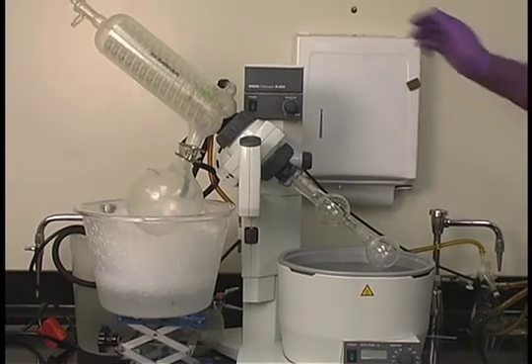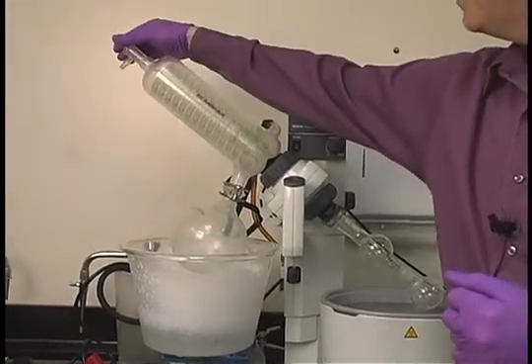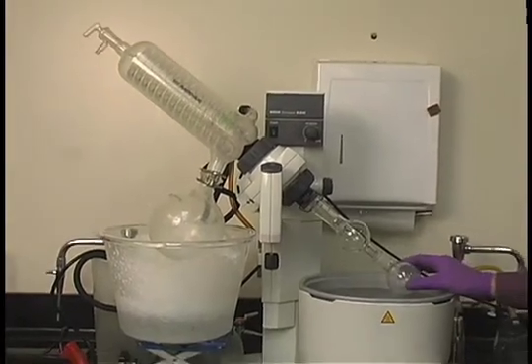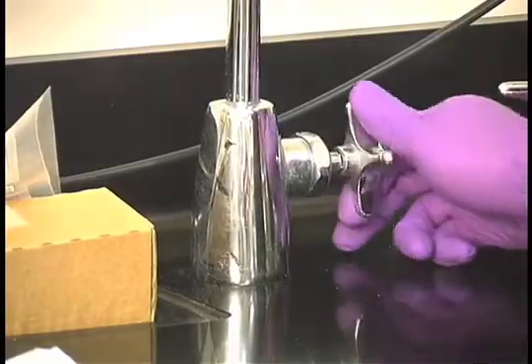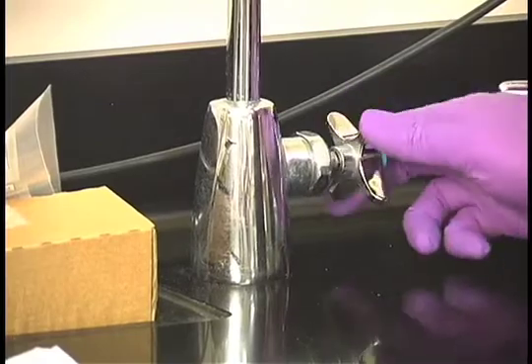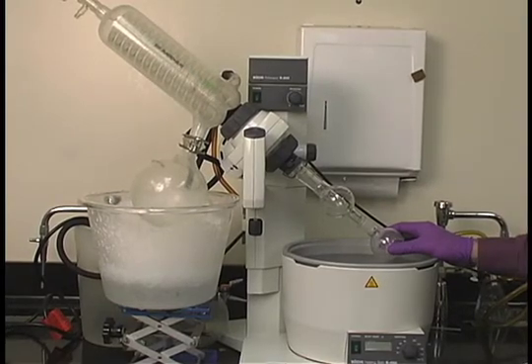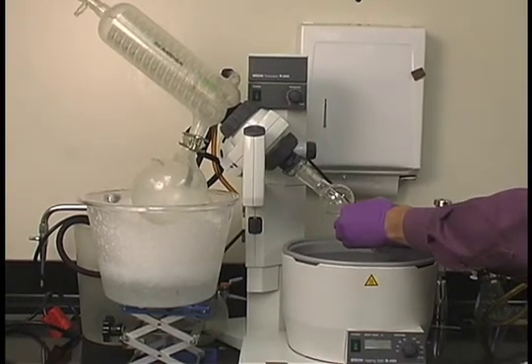Then release the vacuum. Turn off the aspirator. And once it's actually back at room pressure, you can then remove the round bottom flask.